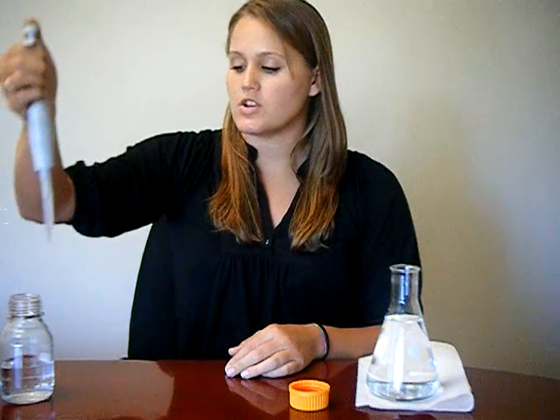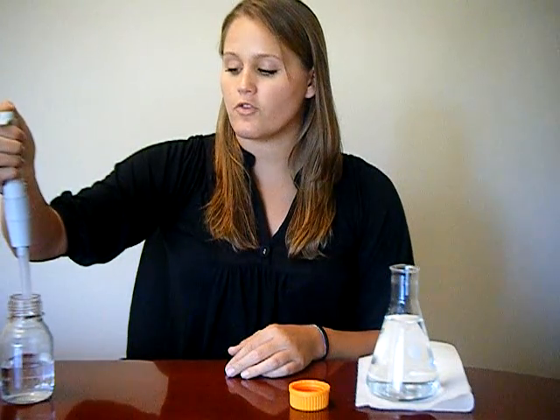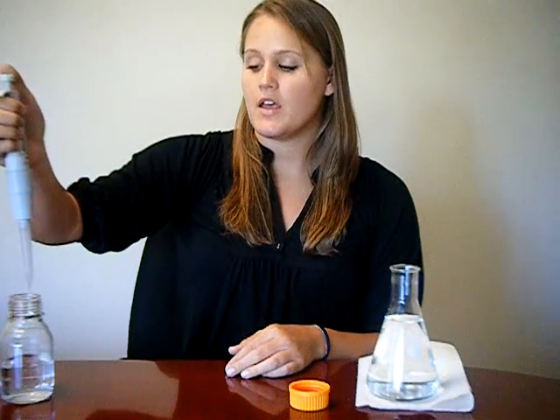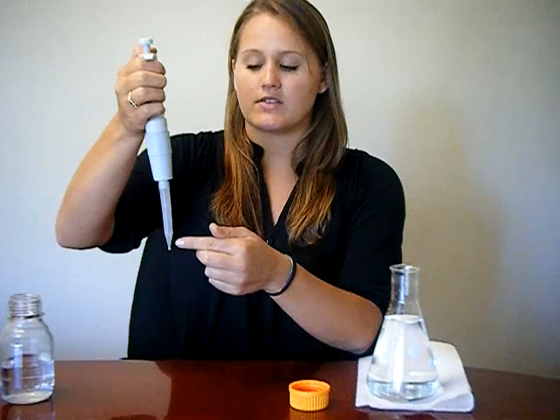Remove the tip from the solution and hover it over your desired location. Press down firmly to the second stop. The second stop is only to be used when expelling a liquid, so that no residual liquid is left in the tip.